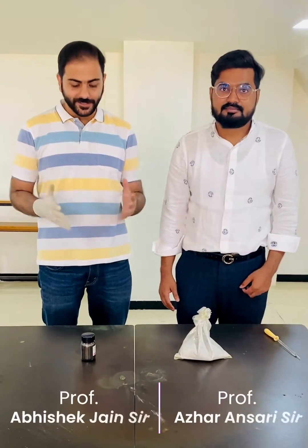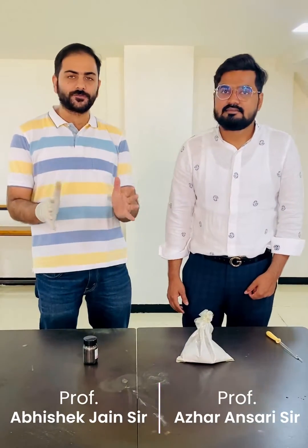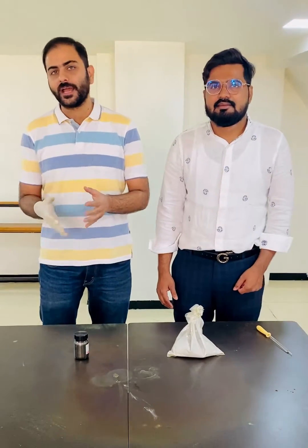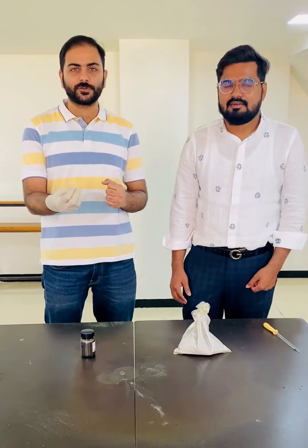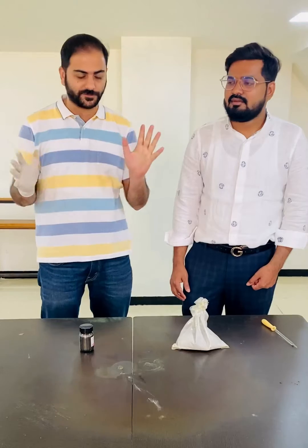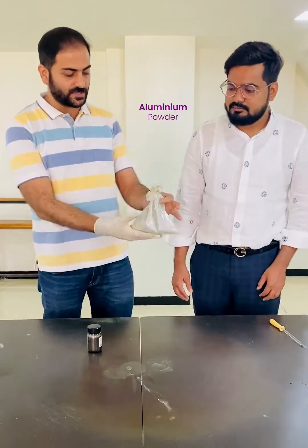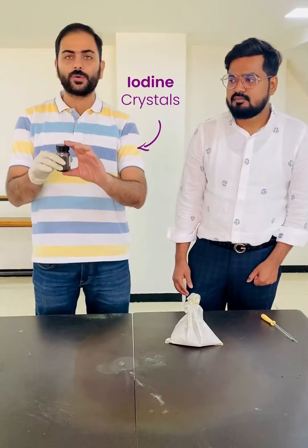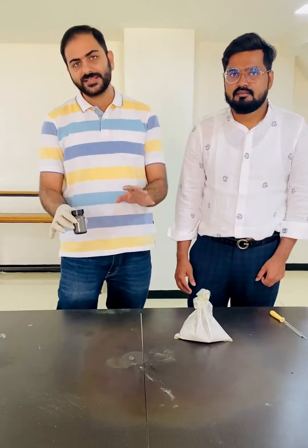Hello everyone, how are you all? Today's reaction is going to be a very beautiful reaction — the reaction is between aluminum and iodine, and you are going to see very beautiful purple colored flames coming out of it. So first of all, let me tell you: this is aluminum powder that we have, and these are iodine crystals.